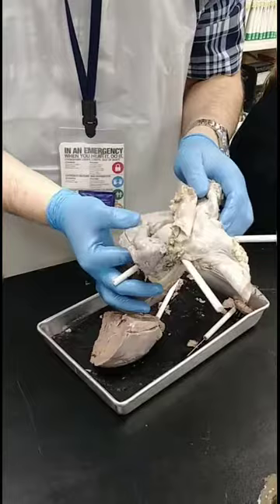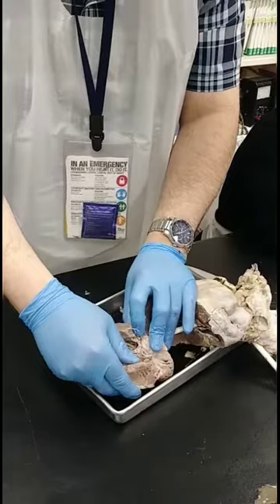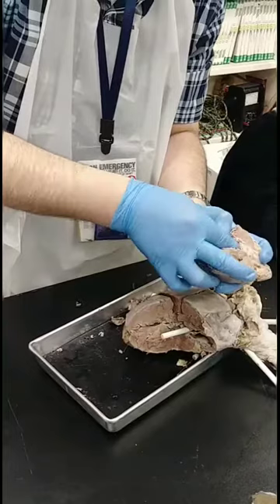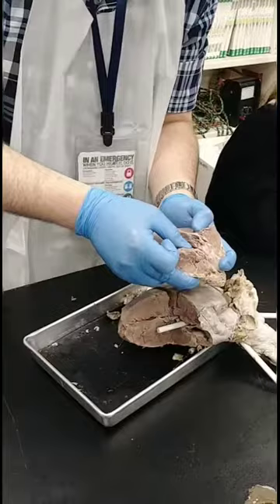All right? So when you sketch what you see, open up more of the left ventricle. See all these heart strings? And you cut up part of the valve. This valve connects it to the atrium. And whenever the heart pumps, these valves open and close because these strings are moving as the heart pumps. The tendons. Sound good? Okay.